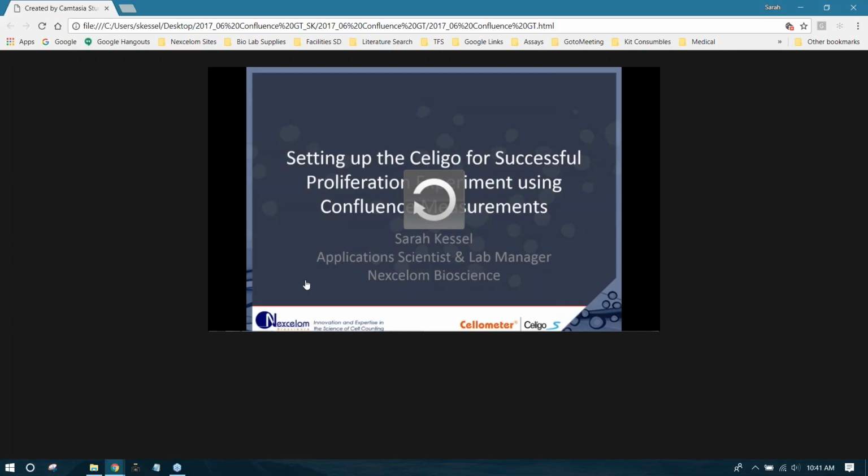We do have another question. Can the hardware autofocus fail in any circumstance? And why are the focusing step distances different in registration well versus other wells? So the registration well is basically you're telling the system how it's going to focus for the entire plate. The hardware focus works when the bottom of the plate is very flat. And so for instance, a U-bottom plate would not be a good plate for hardware focus because the bottom of the plate is U-bottom shaped.